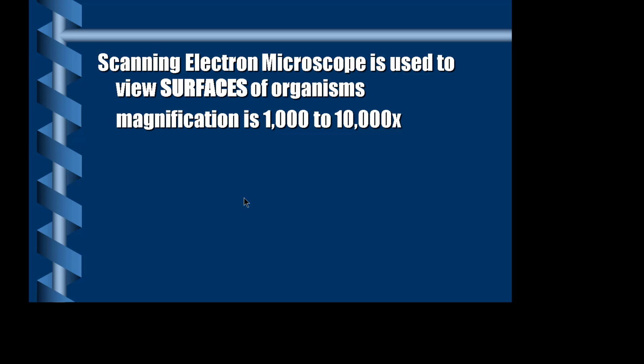So a scanning electron microscope is really good for examining those receptor sites and the shapes, which can lead to finding ways to keep things from attaching there that don't belong there. So that gives you an idea of the scanning electron. Now, again, it's not as powerful, so you're not going to see as detailed internal structure as you would with a transmission.